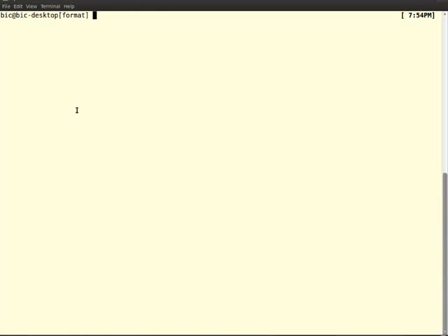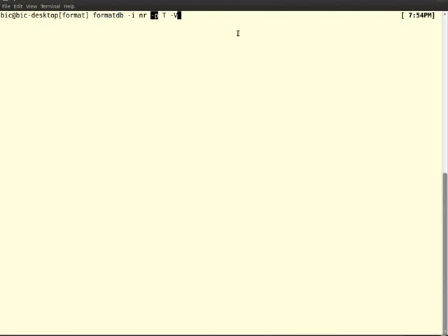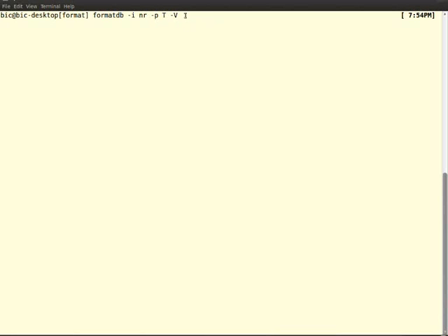To format a database, we are using the formatdb command. So in this case, formatdb and hyphen i means input file. Our input file is nr. And hyphen p is which program file, whether it is a nucleotide or a protein. So our thing is a protein, so we are using t. T for protein and f for nucleotide. And hyphen v is familiar to us; it means verbose. Let's run the program.